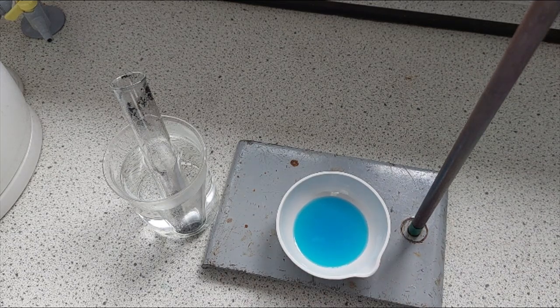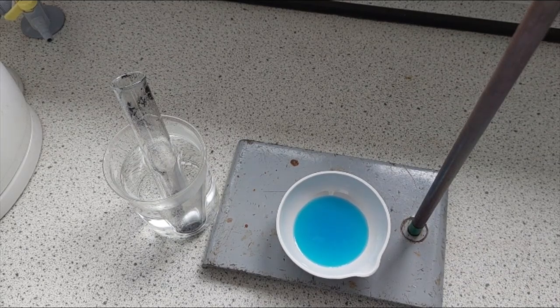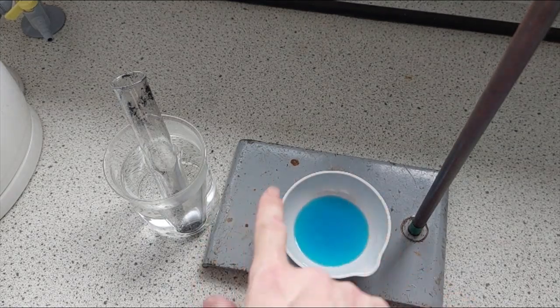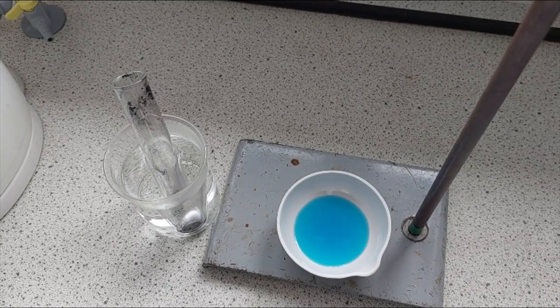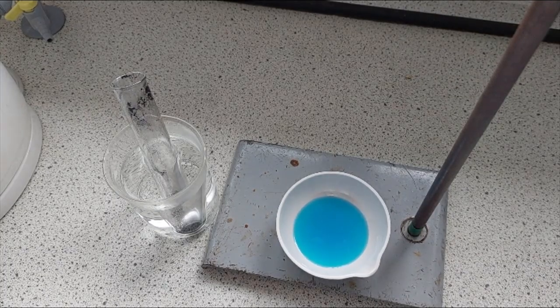Saturated solutions means they've dissolved the maximum possible amount of the solute within them. So if I were to evaporate off some of this water, the mixture would become a saturated solution, and then as it evaporates naturally at room temperature, you'll get lovely crystals beginning to form. The reason we heat it up initially and then leave it to evaporate at room temperature is the crystals will have more time to form, and you'll get bigger and better crystals.